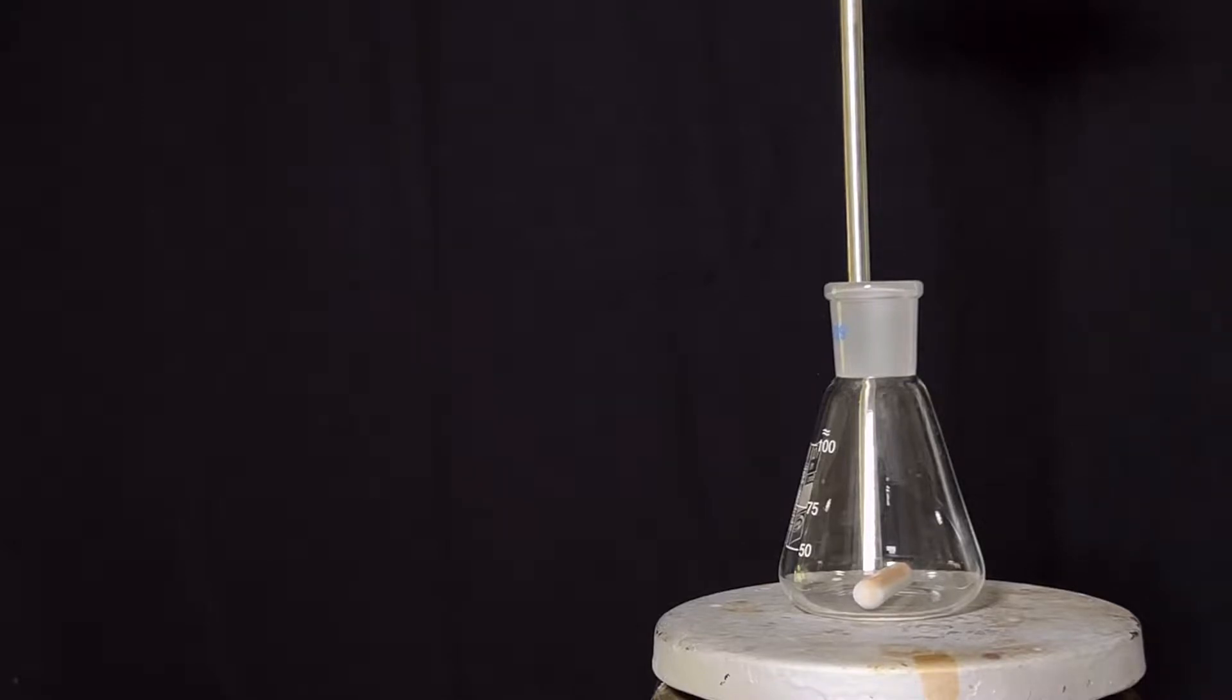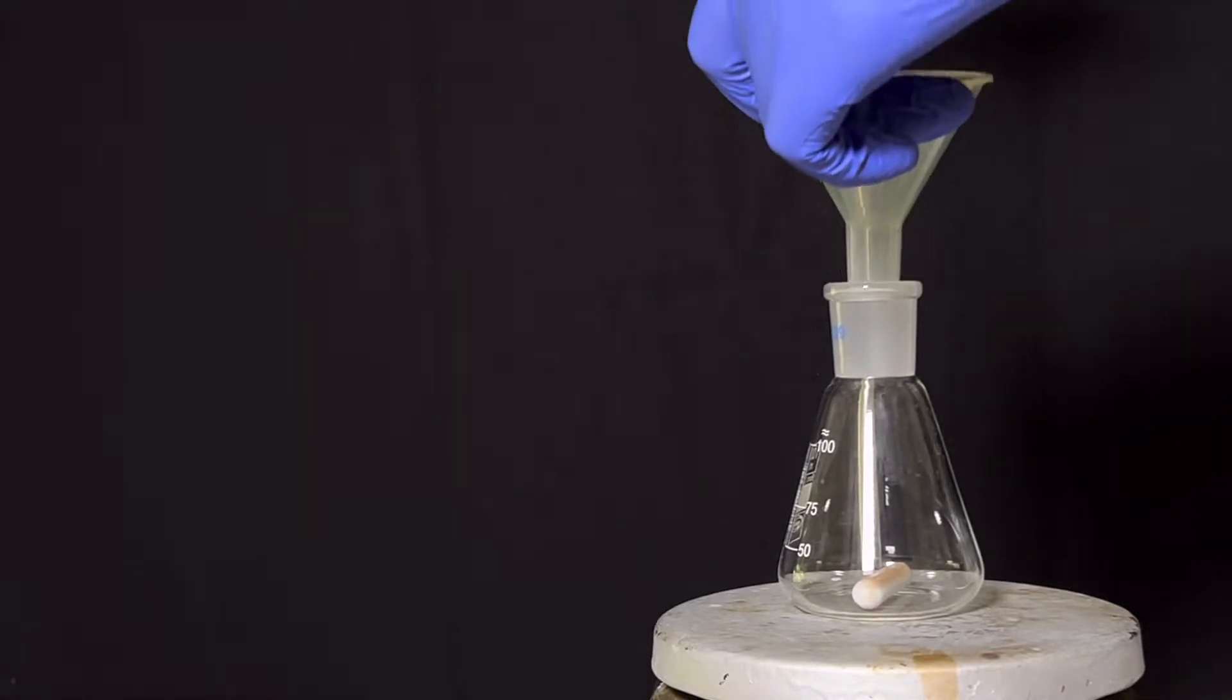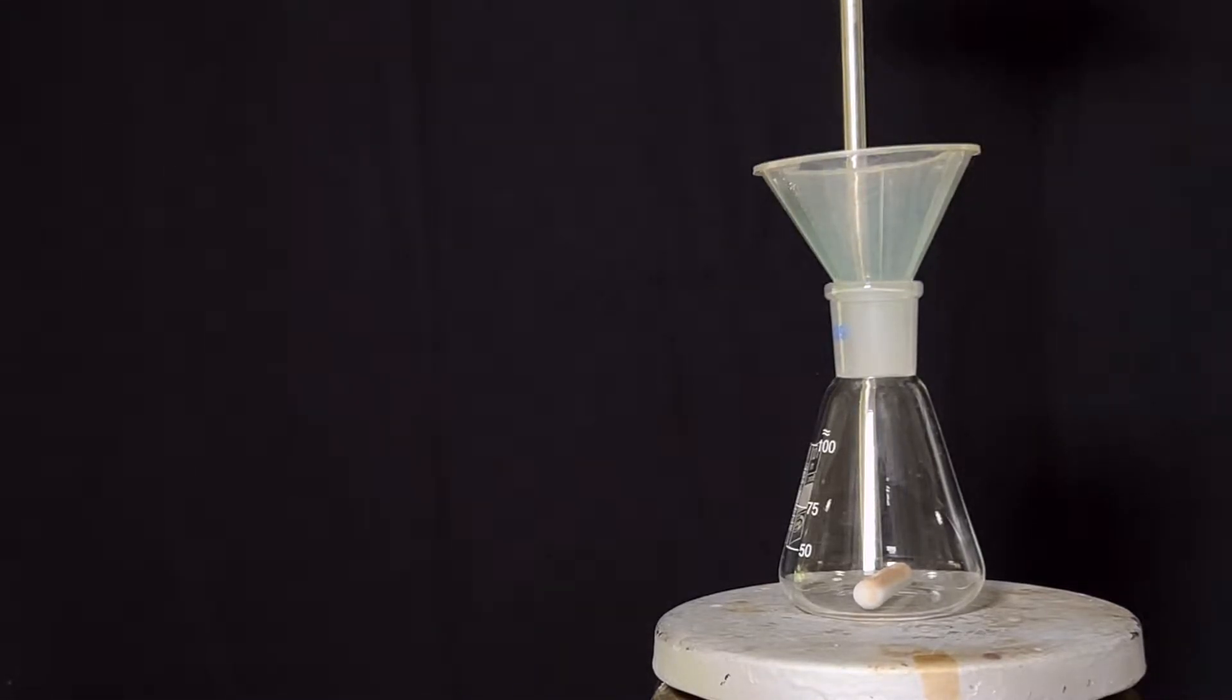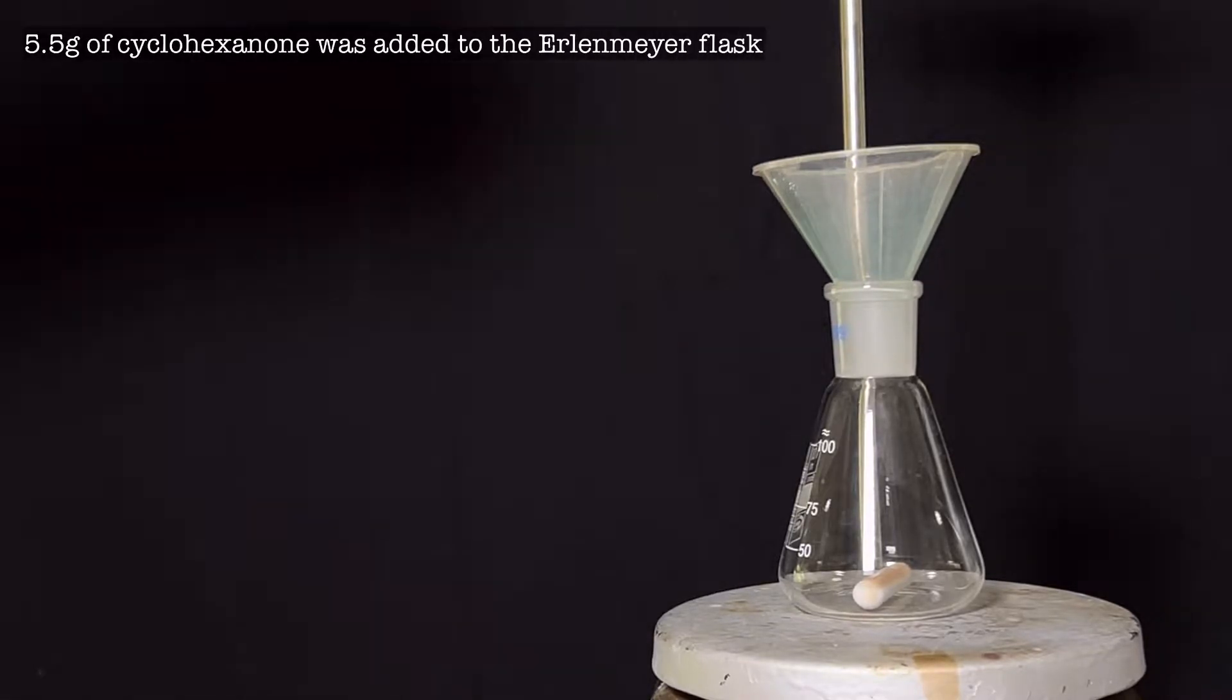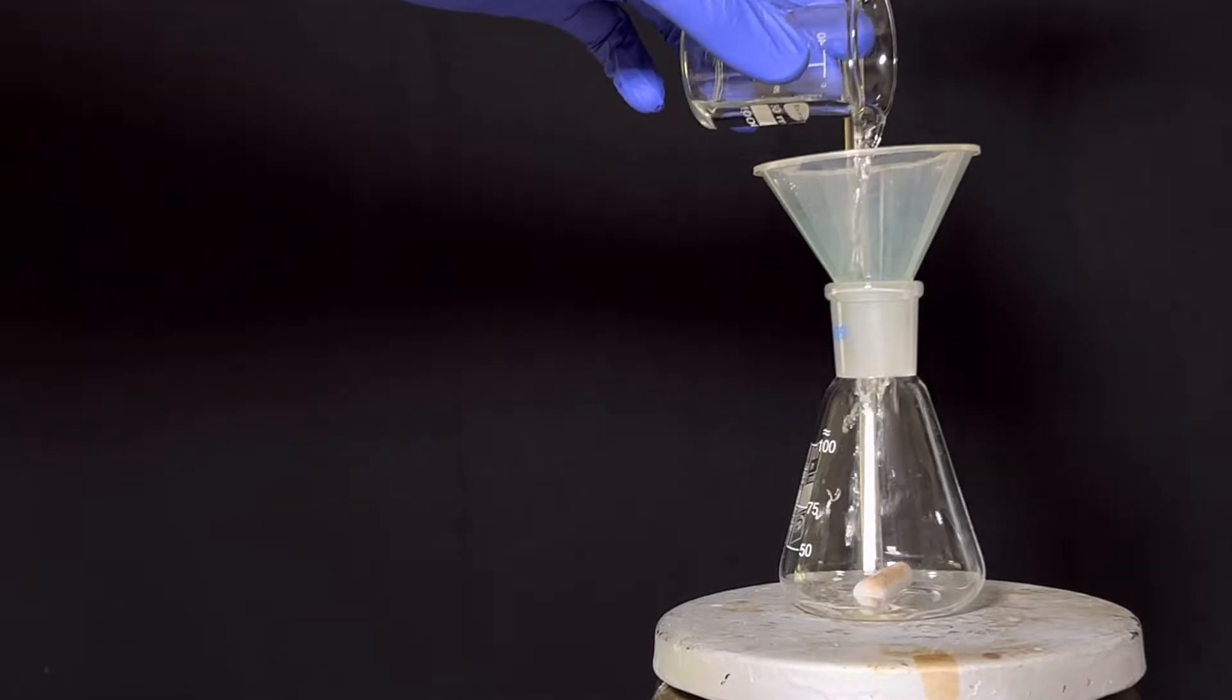Start by placing a 100 ml Erlenmeyer flask on a hotplate stirrer with a stirring bar inside. A funnel was placed on top of the flask and 5.5 grams of cyclohexanone was added to the flask.